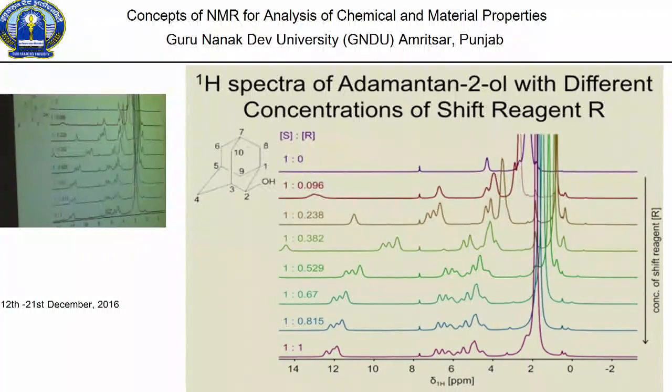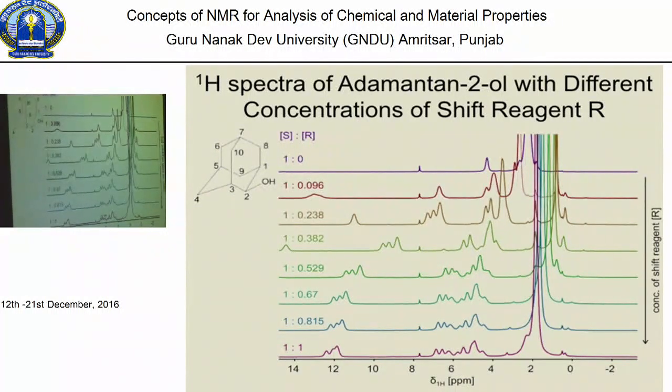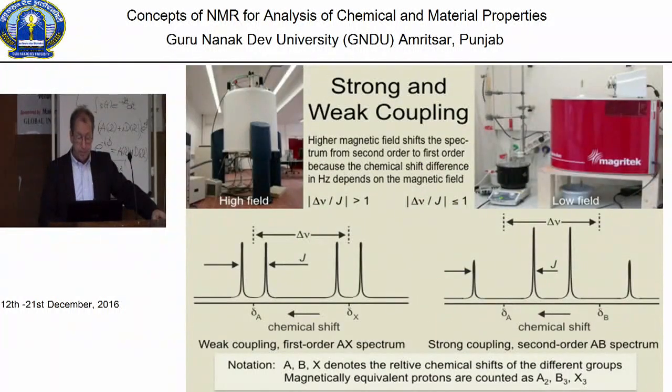As the concentration increases, the chemical shift moves over. So that line from 2 or 3 ppm moves all the way to 12 ppm. So that's something that stretches your chemical shift range and helps you to increase the chemical resolution without going to more complicated experiments, but you will have to use some chemistry.